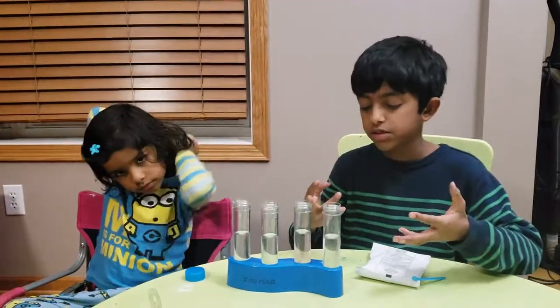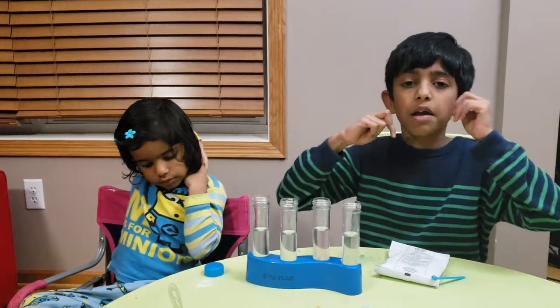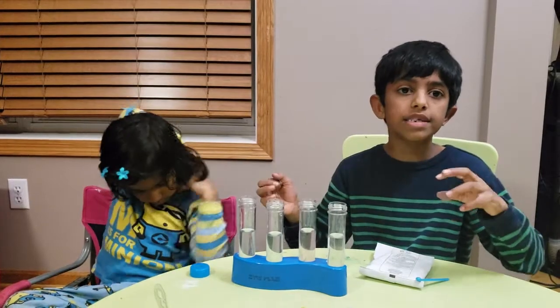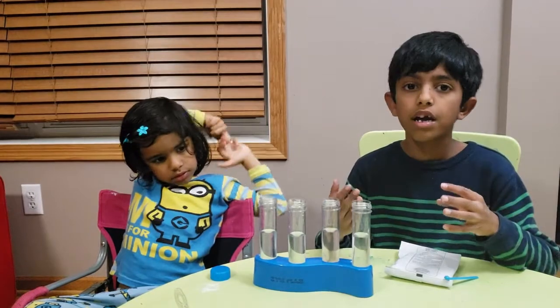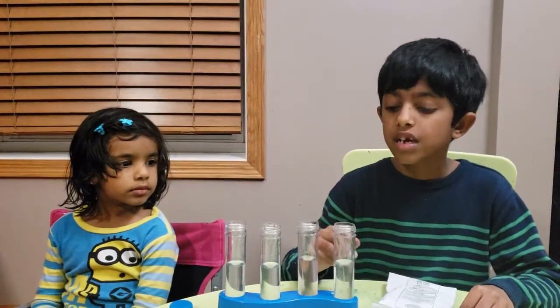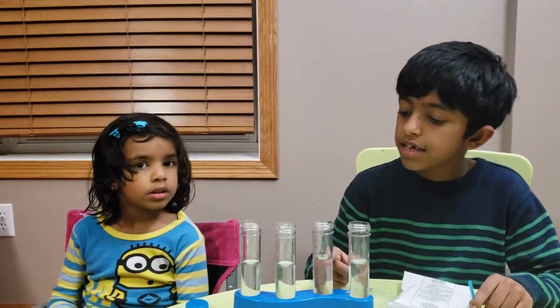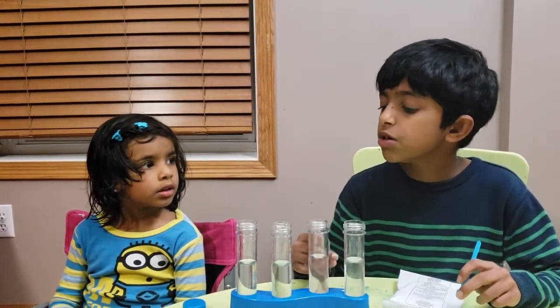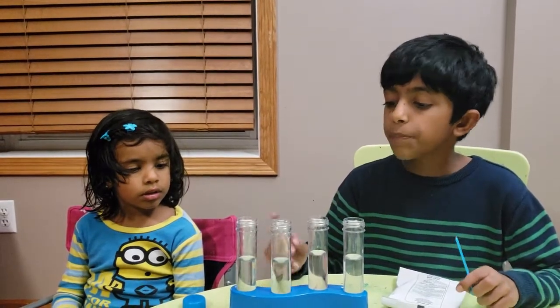We have four different test tubes with four different solutions. Will you be able to tell me which one is acid, which one is a base, and which one is neutral? Because they all look similar and they're all colorless. This has vinegar — this is an acid solution. This has citric acid — this is an acid solution. This has water — this is a neutral solution. This has baking soda — so this is a base solution.